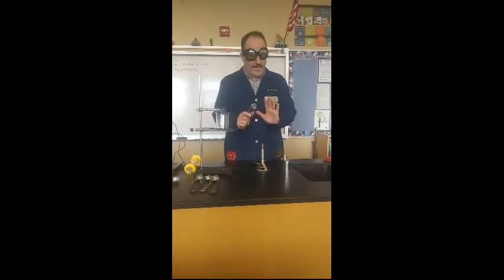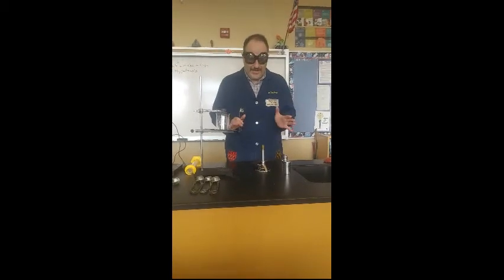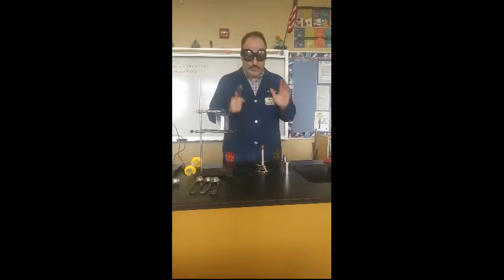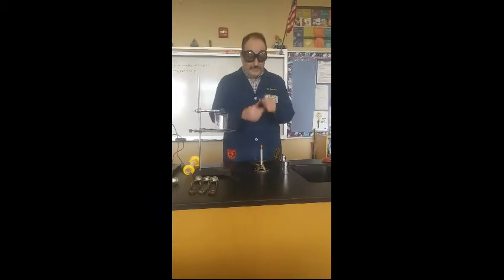Now, when you're all set and ready, you want to make sure that you go ahead and do it. Now don't freak out. Freaking out is what causes people to get hurt, all right? I can leave this gas on for hours and I can light it and there's no problem. So don't worry about having to light it quickly or anything. Just calm yourself, collect it, and go for it.